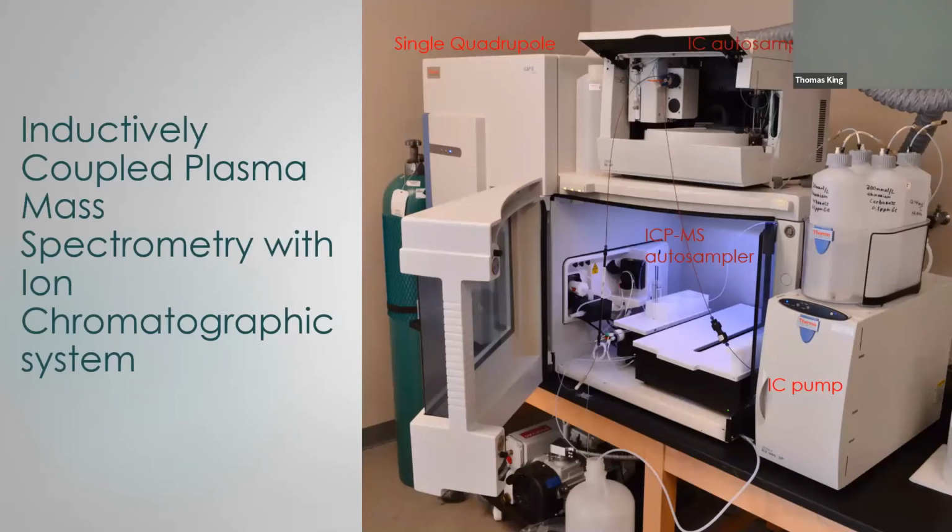And here's a picture of one of our instruments. Inductively coupled plasma mass spectrometry with an ion chromatographic system. This is the single quadrupole instrument. This instrument has an IC system attached for the speciation of arsenic or chromium. I'll discuss the speciation later. And in the middle is the autosampler where we put the samples.